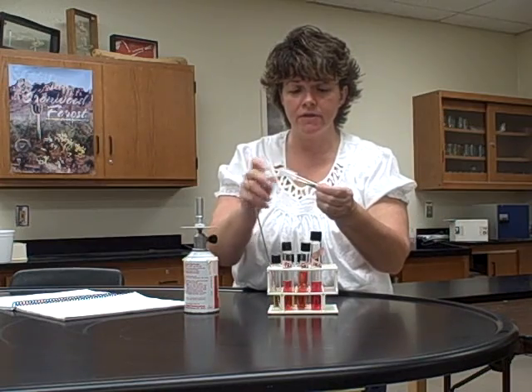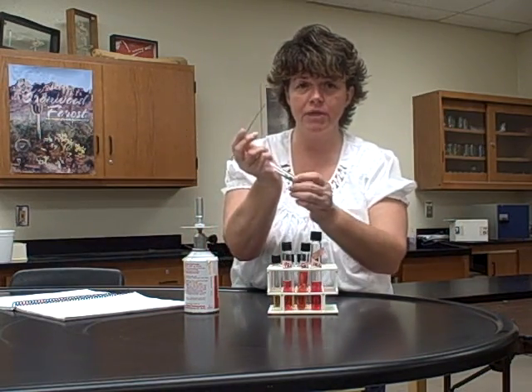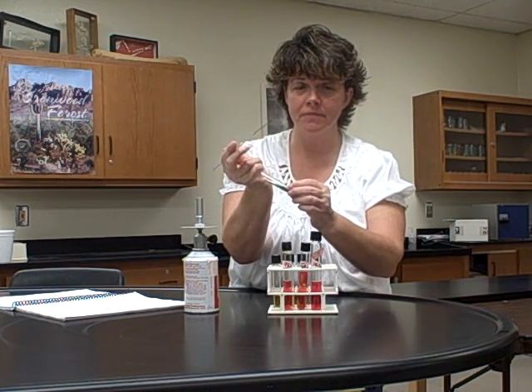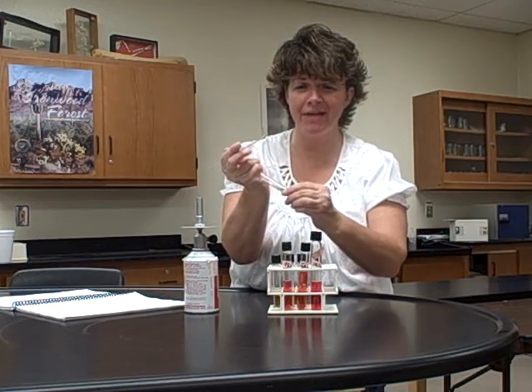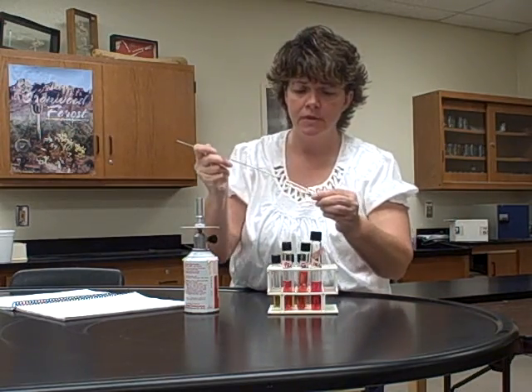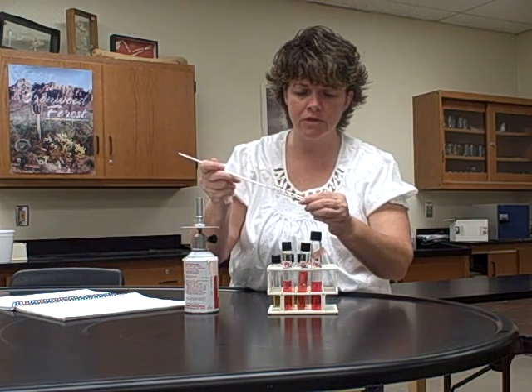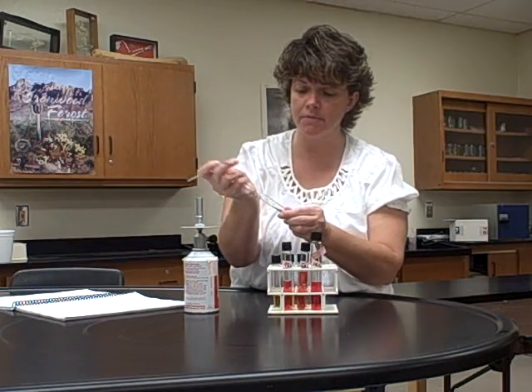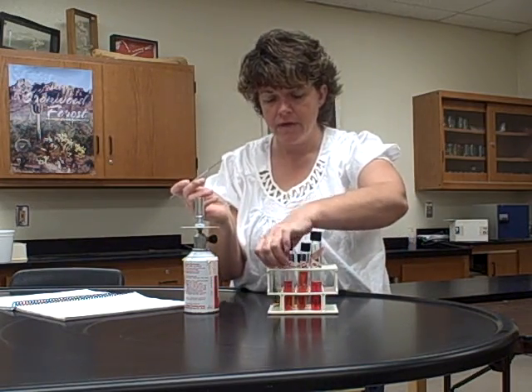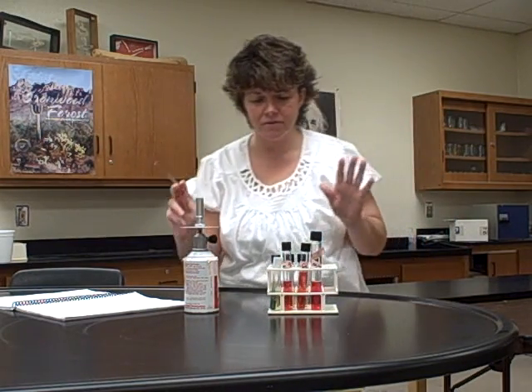Now, recall that this, and I'm just going to pretend that I've done everything else, and I just want to show you again how to inoculate a slant. Okay, remember, pretend I've already sterilized everything, I already have the bacteria on the loop, and you don't want to gouge the agar, you just want to start at the bottom and slowly come toward the top. Okay, and you would do all the sterilization that we've done before. Okay, so pretend I have all of those inoculated, I've flamed my loop and done all those things.